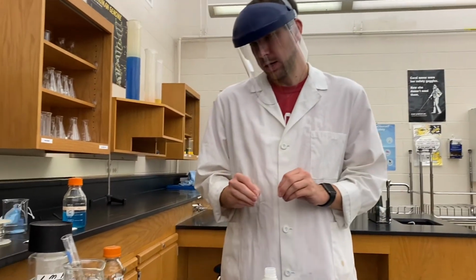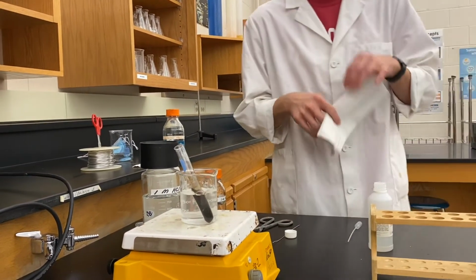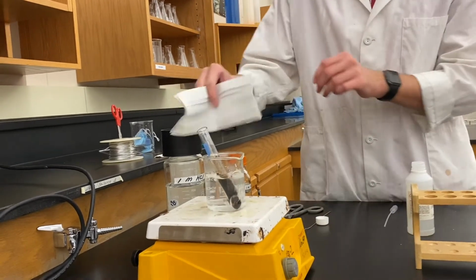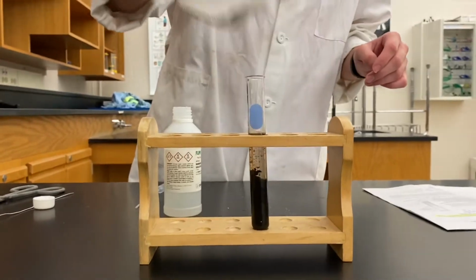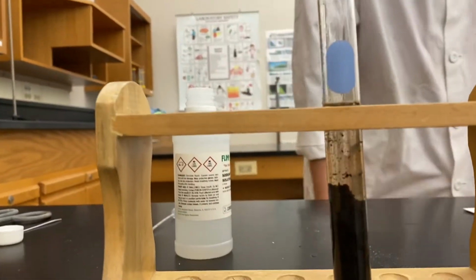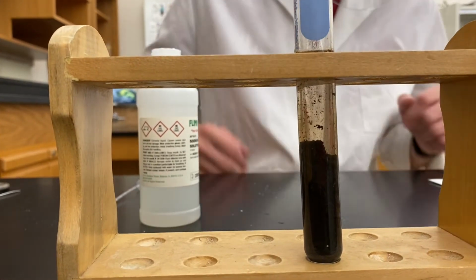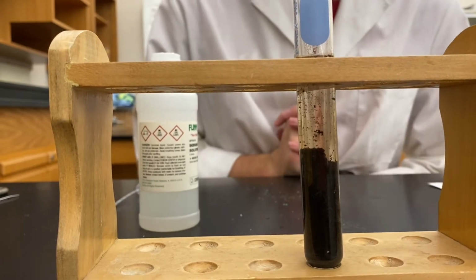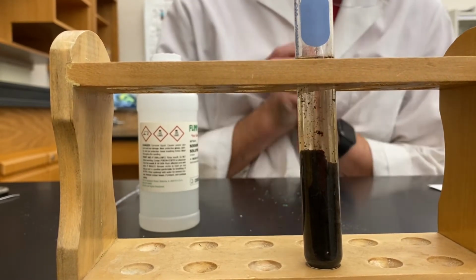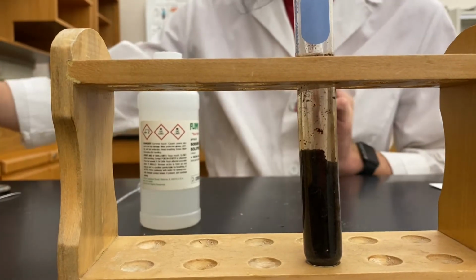I'm now going to remove the test tube from the hot water. I forgot my test tube tongs, so I'm going to do not good lab procedure and grab it with some paper towel so I don't burn myself. Put it back in our test tube holder. We want to allow this to cool for a little bit, and then I'm going to add some hydrochloric acid to the test tube to cause our next reaction.